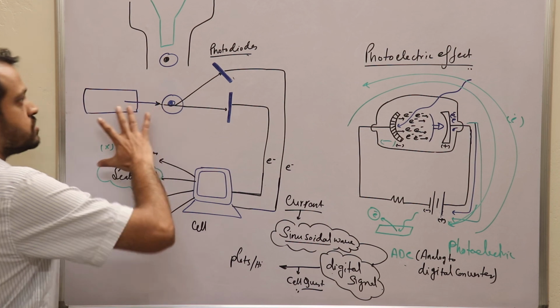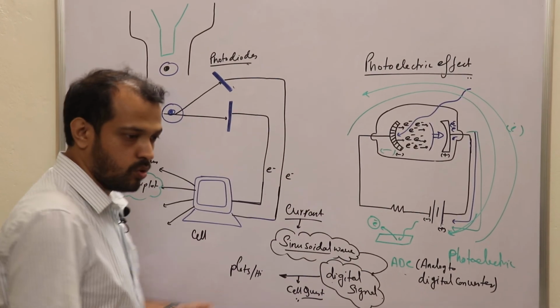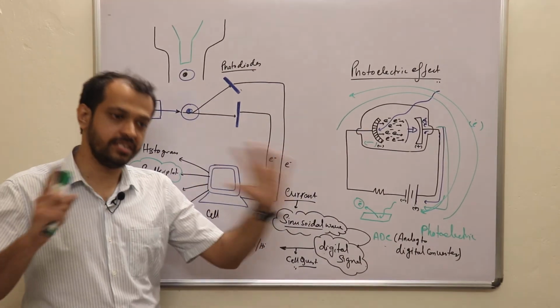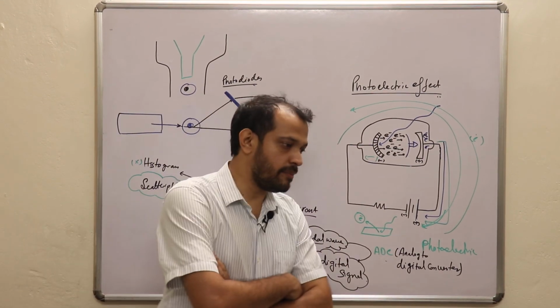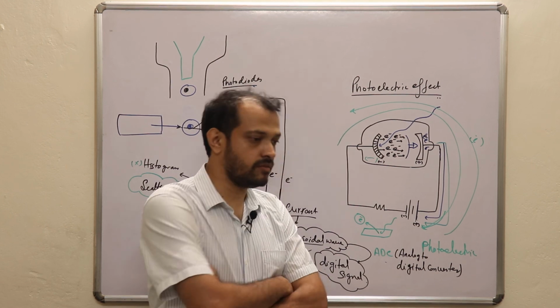So this was your whole idea of the flow cytometer, and now we will be discussing the applications of the flow cytometer, which is called flow cytometry.